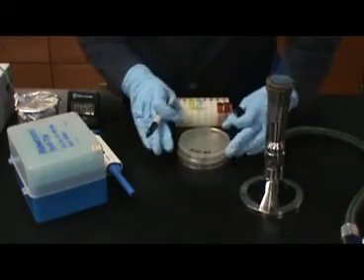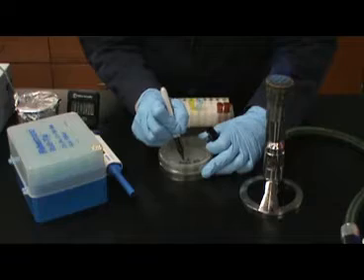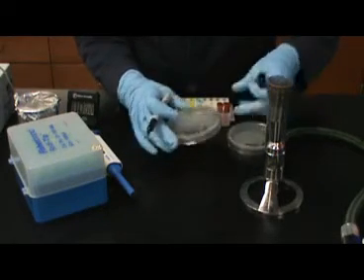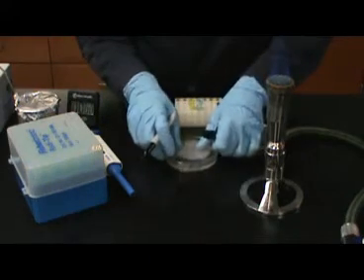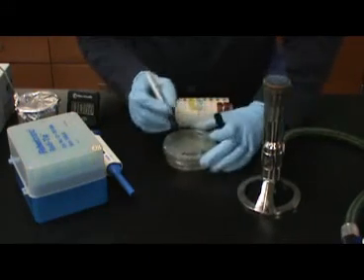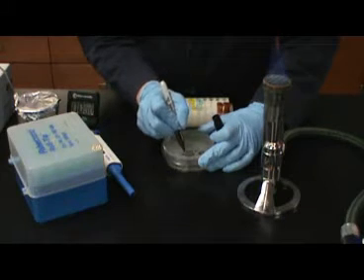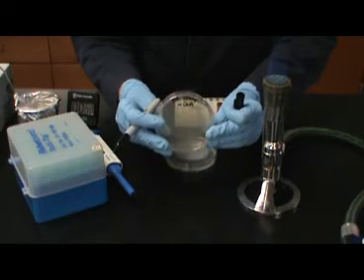You are now ready to begin inoculating plates. The media used in this experiment is nutrient agar that has been supplemented with ampicillin antibiotic. You will need 2 plates, one labeled positive DNA. This will be used for the positive microcentrifuge tube, and negative DNA. This will be used for your control, or the tube labeled negative.